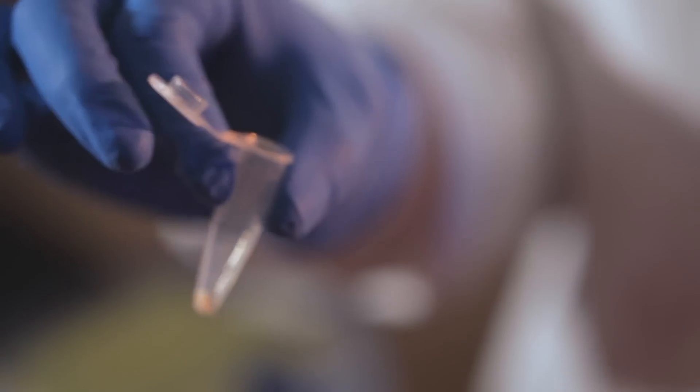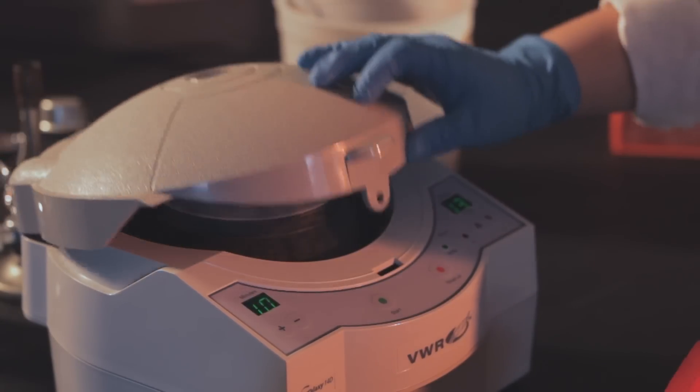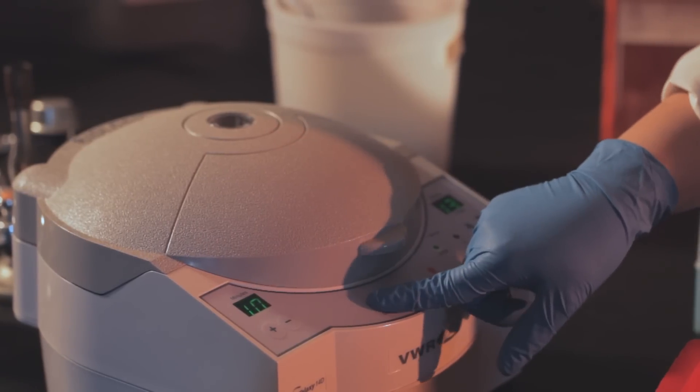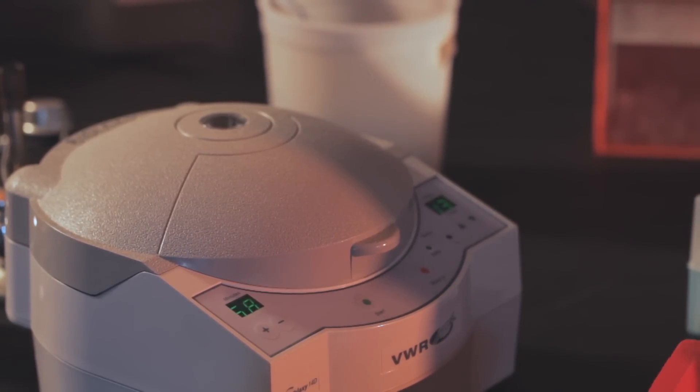In some cases you may want to spin down an additional 1.5 milliliters of bacterial culture in the same tube to increase plasmid DNA yield.